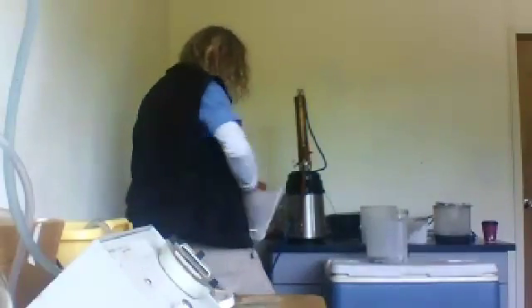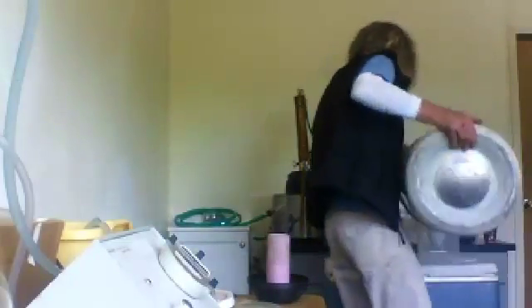Okay, so what I'm doing now, comes up. Now I'm going to winterize it. This will take out the first solids. Now, is this a decarboxylated extract, already decarboxylated? Yes. Oh, which one? That you're winterizing. Oh no, this will end up being different. Yeah, it's for a medical person. I imagine you winterize before decarboxylation. Yep. Absolutely. I always like to leave the choice at the end to decarboxylate it.